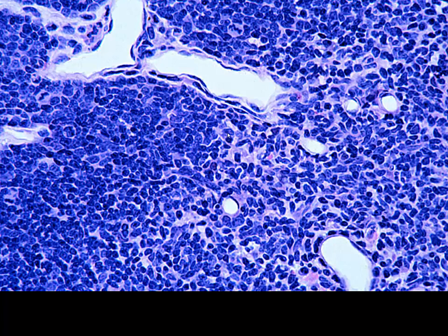Once again, just the density that we see different present out in the cortex. And here we're looking in the paracortex into the medullary region. One interesting thing in this particular field, we've got our vessels running along. You've got some connective tissue around here, basement membrane, but we also have these cells that are lining this. These are the epithelial reticular cells that are sheathing these vessels in the cortex.